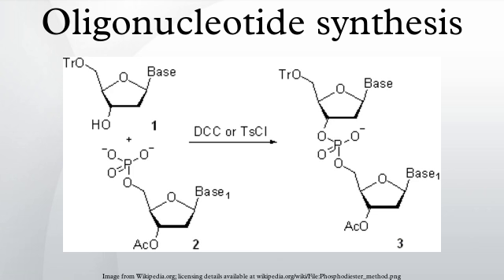1. Most often, the 5'-DMT group is removed at the end of the oligonucleotide chain assembly. The oligonucleotides are then released from the solid phase and deprotected by treatment with aqueous ammonium hydroxide, aqueous methylamine, their mixtures, gaseous ammonia or methylamine or, less commonly, solutions of other primary amines or alkalis at ambient or elevated temperature. This removes all remaining protection groups from 2'-deoxyoligonucleotides, resulting in a reaction mixture containing the desired product.